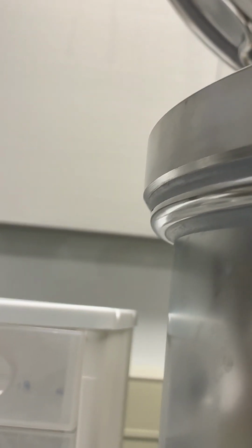We'll just hold it, I guess. If you look down in there, that's where the electron beam deposition system is, right? The electrons come from one part, and then they hit your target, warm it up. That's what you're seeing through this window here, normally. And so that's where the metal is coming from, right? Yeah. If you look, there's a spot right here where all the metal is.